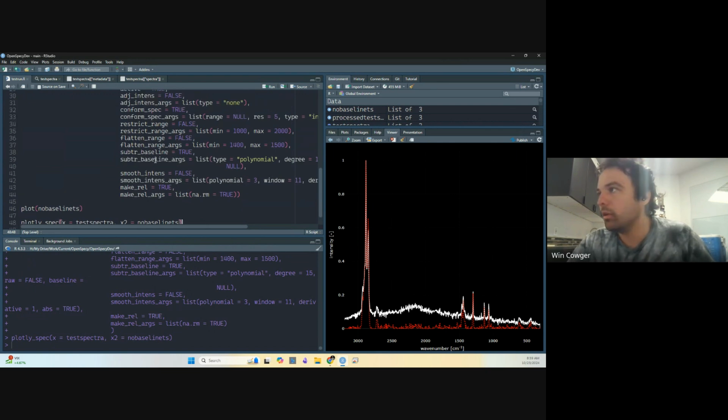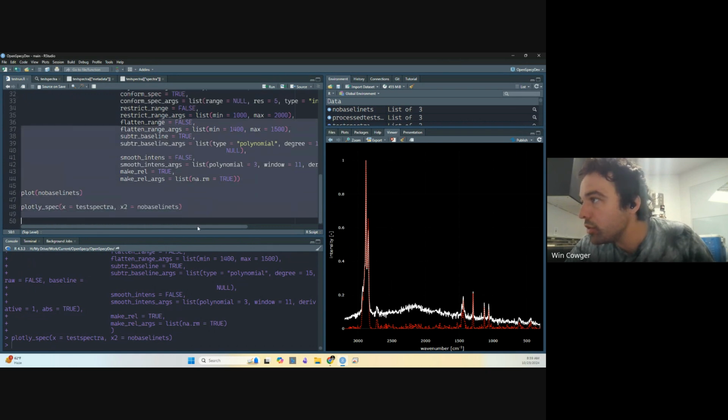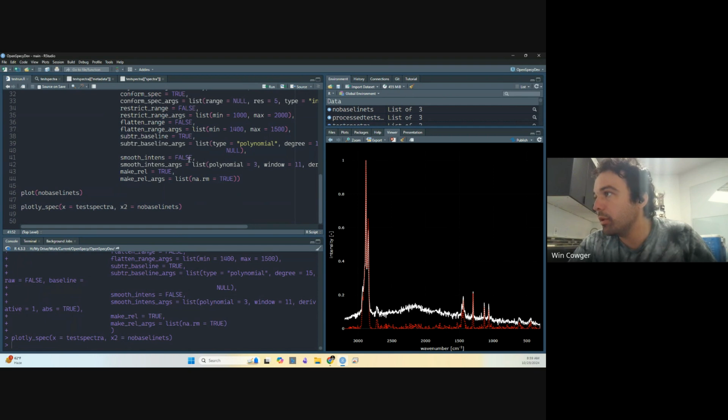Okay. Well, I'll just finish this here. Restrict range. Okay. Polynomial. Smooth intense.